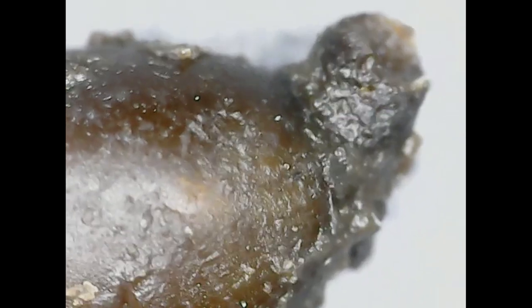It looks like it's cracked or damaged. And I can't quite see if anything's moving in there. Focus a little bit more. That was the opposite of what I wanted. At this closer range, even the thickness of the cocoon itself means I can only focus on one part at a time. But that is the surface of a worm cocoon.